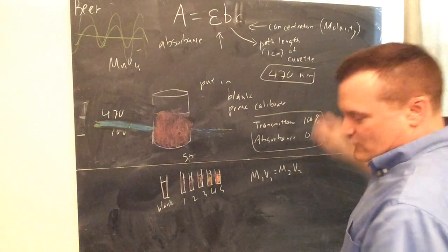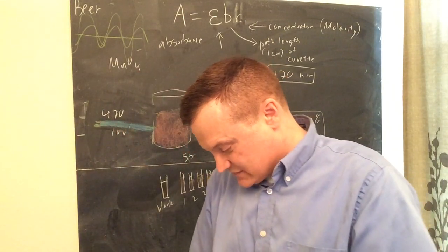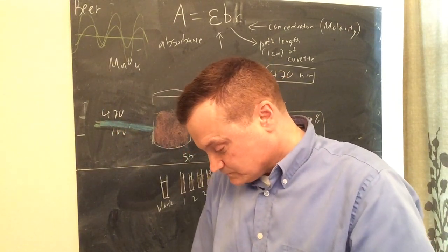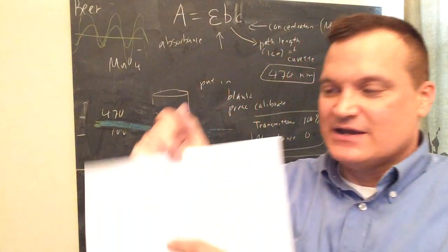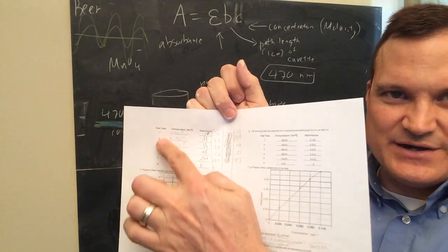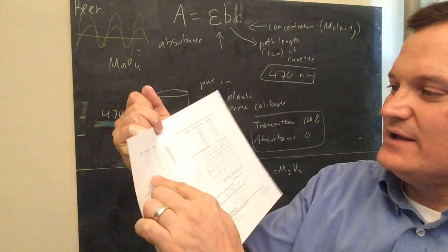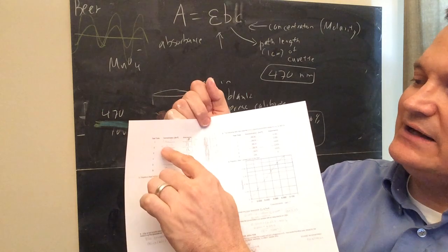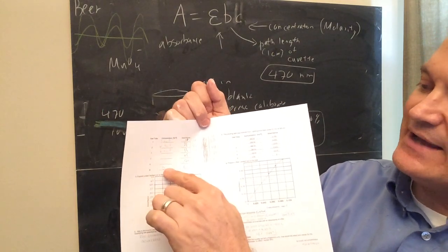We're going to measure for, actually, this is on your lab. I keep saying it here, but let me show you where it is on the paper. Actually, there are 5 test tubes. They're on this last page, this one right here. There are 6 test tubes. Well, 5, and then B is the blank one. And it says, what's the molarity inside each one? You're going to put the molarity here. And of course, it'd be 0 for the blank, 0 molarity.